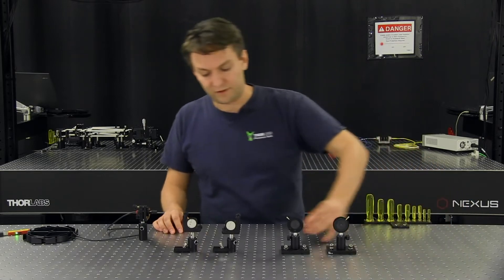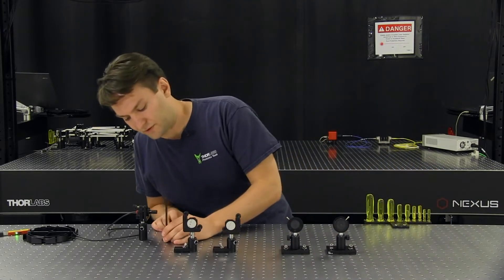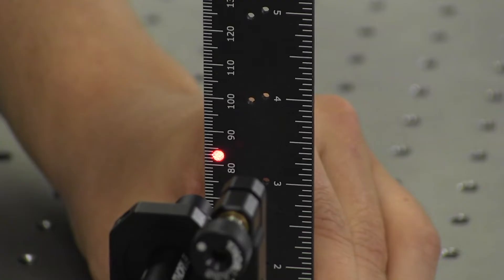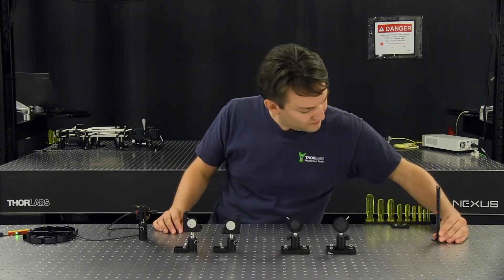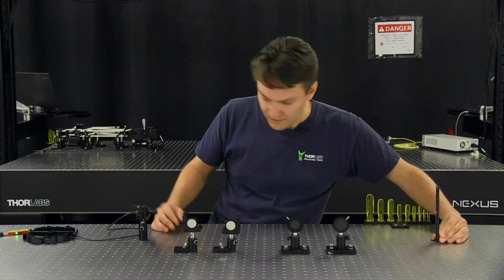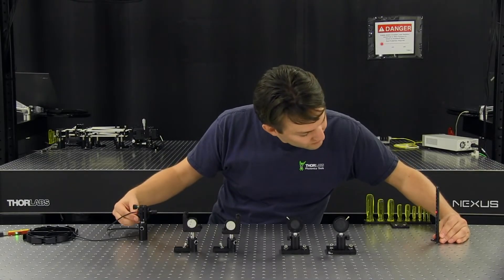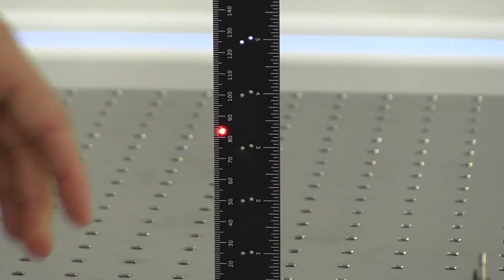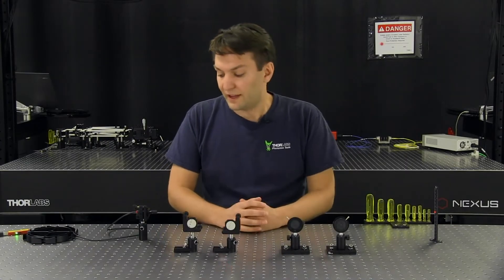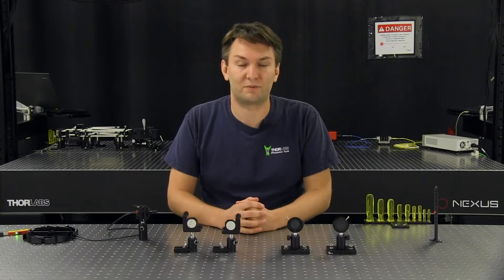So again, I've moved the device. So I'm going to come up close again. Take a look where I think it is. I'll make a slight tweak. Okay. So now I have my collimated laser diode package traveling in a straight line with respect to the table.